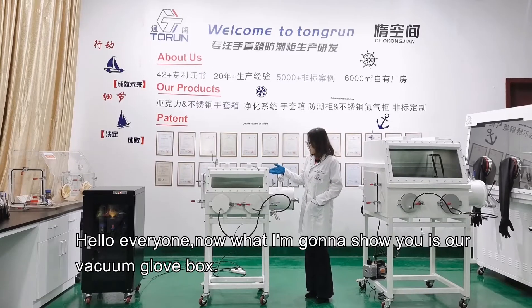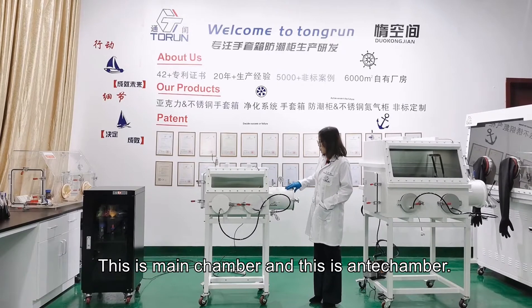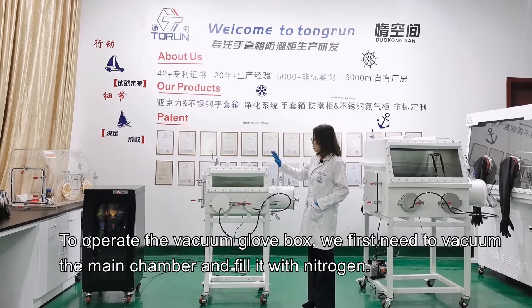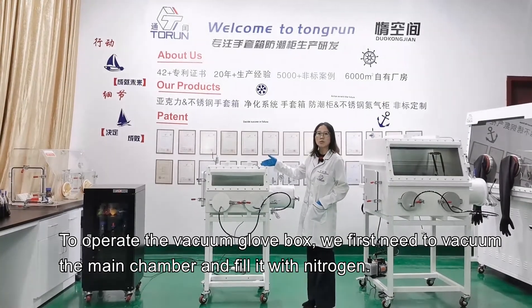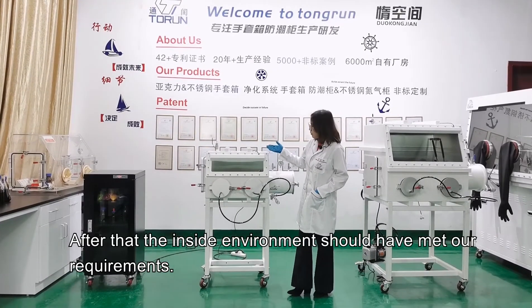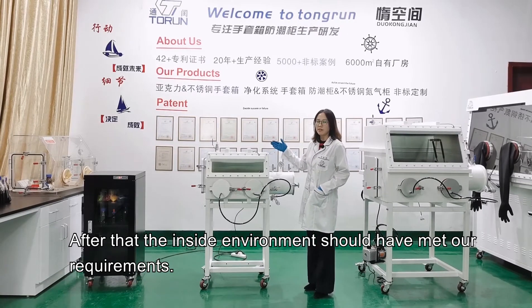Hello everyone. What I'm going to show you is our vacuum glove box. This is the main chamber and this is the anti-chamber. It's well known that the main chamber is vacuumed and filled with nitrogen gas. Many customers often ask what the anti-chamber is used for. To operate the vacuum glove box, we first need to vacuum the main chamber and fill it with nitrogen gas. We generally recommend three to five repetitions, after which the inside environment should have met our requirements.